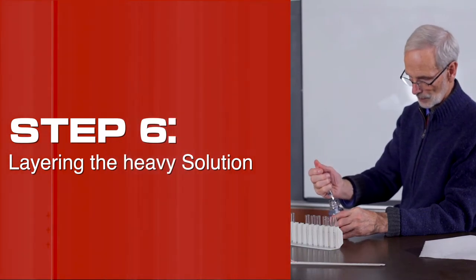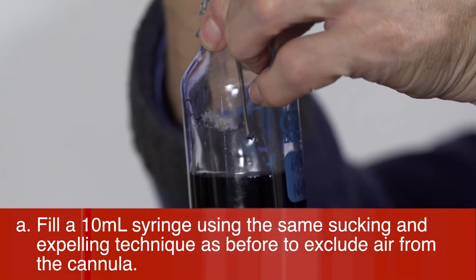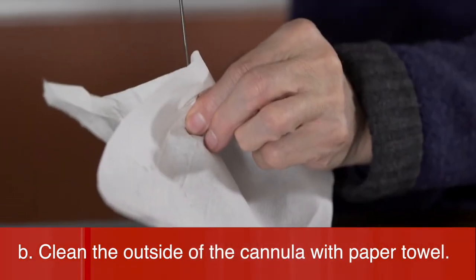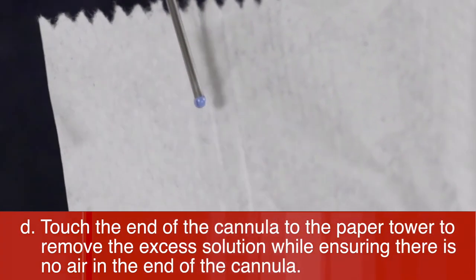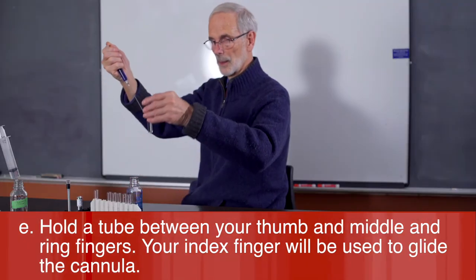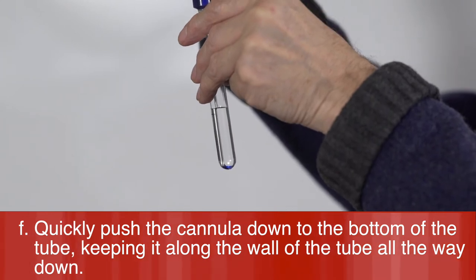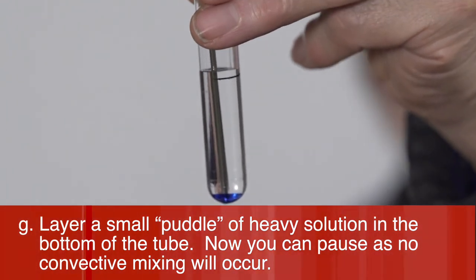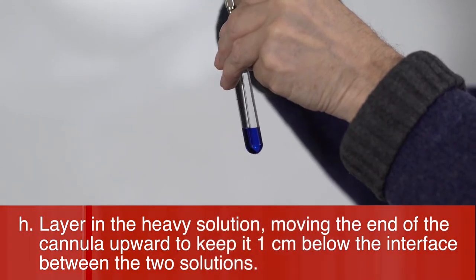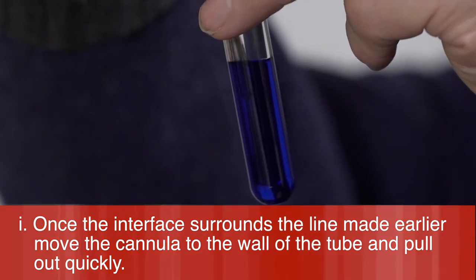Step 6: Layering the heavy solution. Fill a 10 milliliter syringe using the same sucking and expelling technique to exclude air from the cannula. Clean the outside of the cannula with a paper towel, then push a small droplet of liquid out of the end of the syringe. Touch the end of the cannula to the paper towel to remove excess solution while ensuring there is no air in the cannula. Hold the tube between your thumb and middle and ring fingers — your index finger will guide the cannula. Quickly push the cannula down to the bottom of the tube, keeping it along the wall, and layer a small puddle of heavy solution at the bottom. Continue layering the heavy solution, moving the cannula upward to keep it one centimeter below the interface. Once the interface surrounds the marked line, move the cannula to the wall of the tube and pull out quickly.